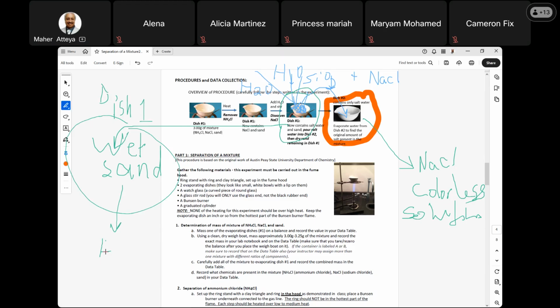Okay, heat, and then I will get dry silicon dioxide, sand.